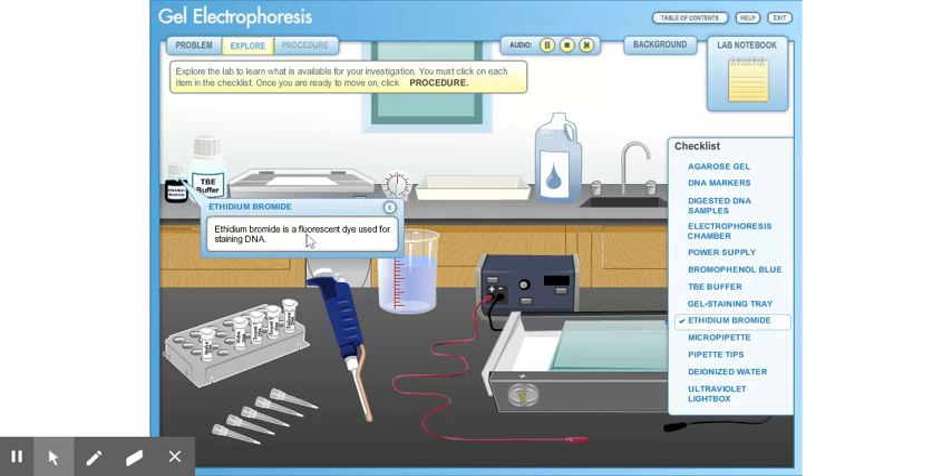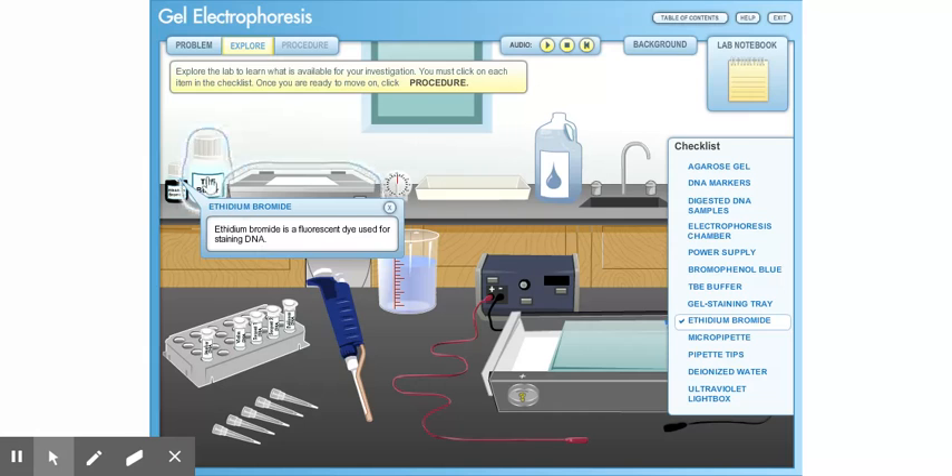Ethidium bromide is a fluorescent dye used for staining DNA. TBE buffer solution is used to help carry an electric current. TBE buffer is added to the gel in the gel box.